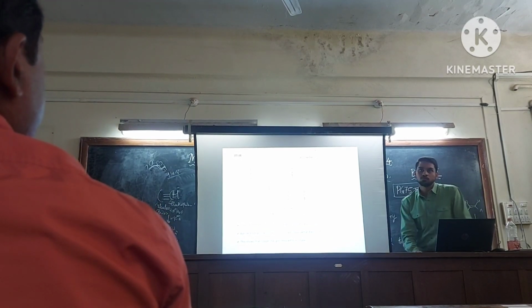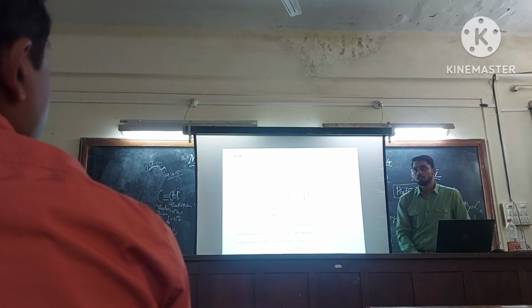Iron element, how did you do this, is this iron? KBr pellet taken, sir.